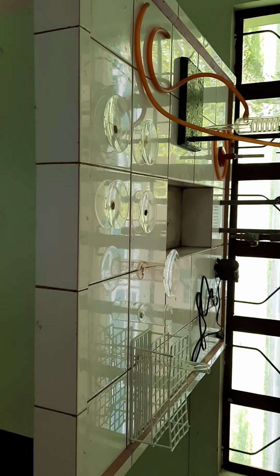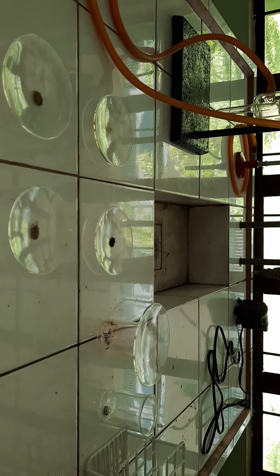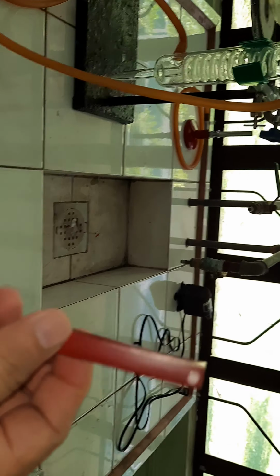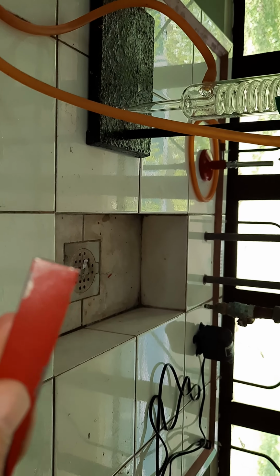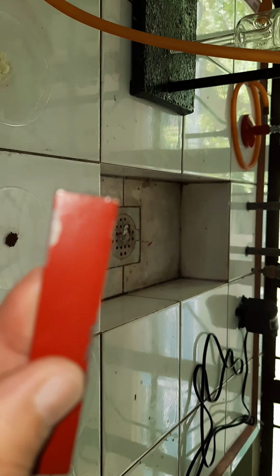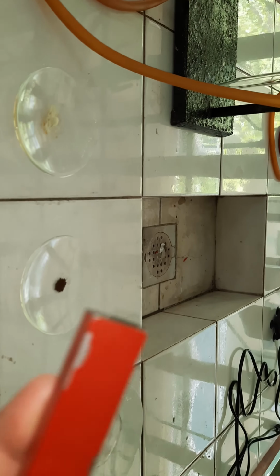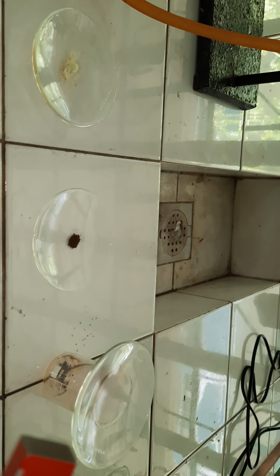Good morning, class, once again, and let's continue with our experiment number 5. At this point, as instructed in the procedure, I have here a bar magnet. I will let this bar magnet pass through our sample of sulfur powder and iron filings. Now observe what will happen as I pass this magnet over sulfur powder and iron filings.